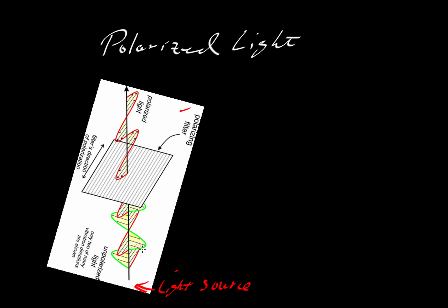And he's showing light vibrating in two directions, kind of an east-west direction here in green and a north-south direction in red. But in reality, of course, the light can move in any direction, as he very nicely explains in his figure. So you can imagine light vibrating in all possible directions as it moves upwards in the sense of this diagram. So it's vibrating in all these planes.